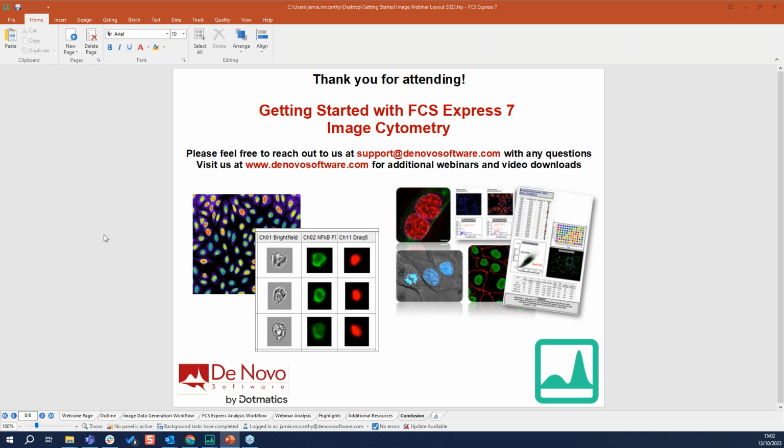So FCS Express is not only for analyzing flow cytometry data, but it can also provide you the tools you need to analyze your image cytometry data as well. Today's webinar is going to introduce you to some of those tools, features, and capabilities that the software has to offer. And FCS Express has included image cytometry analysis tools beginning back in version 4, and we've included it in every version of FCS Express since then.